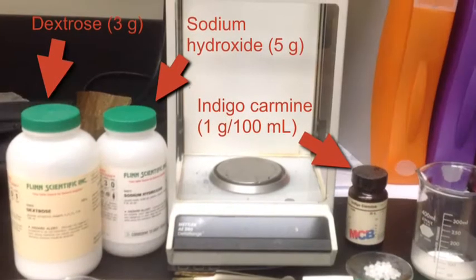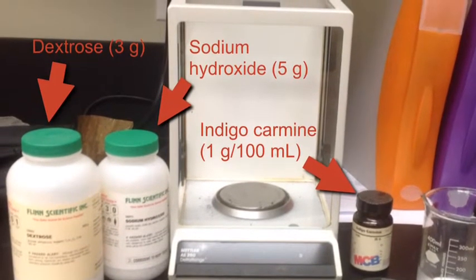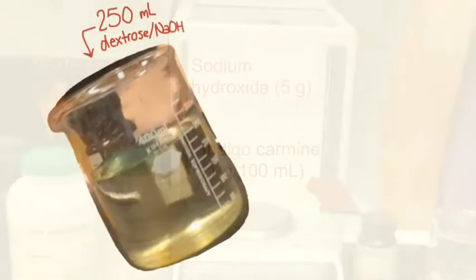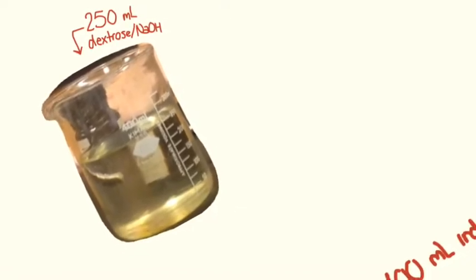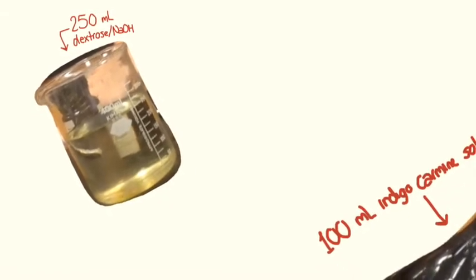We start by preparing our solution. Measure out 3 grams of solid dextrose and 5 grams of solid sodium hydroxide. We dissolve these two solids in 250 milliliters of distilled water. Next, we prepare the indicator by dissolving 1 gram of indigo carmine in 100 milliliters of water.